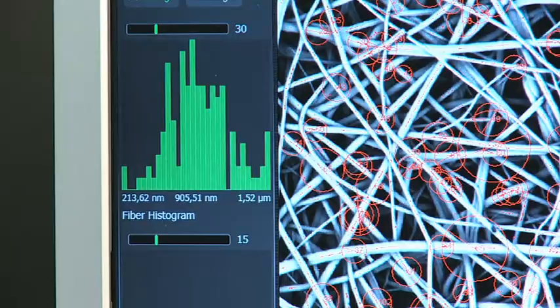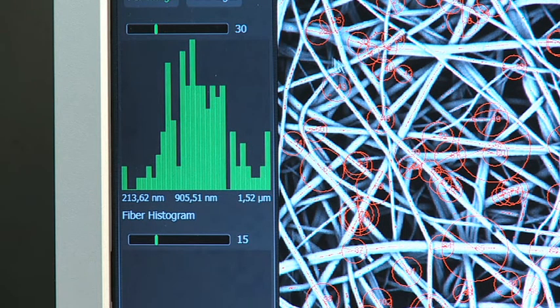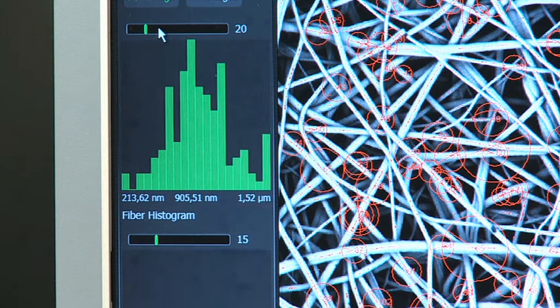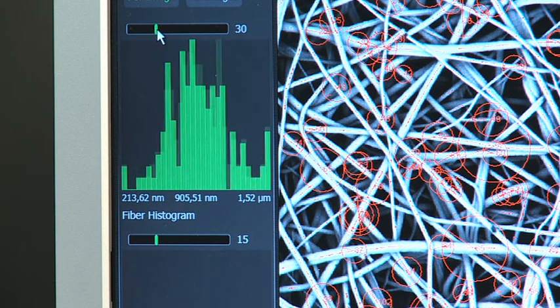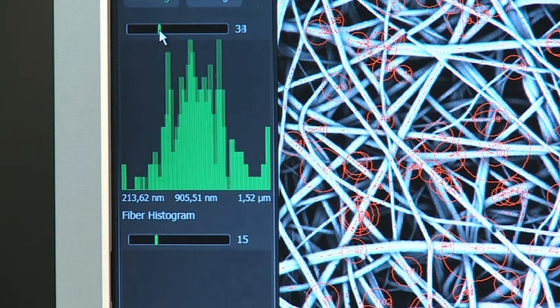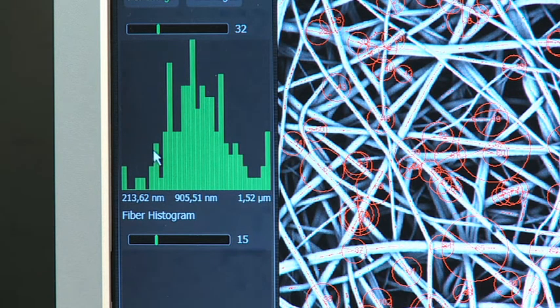The interactive histogram on the left can be scaled with different numbers of bins. Average fiber size is displayed underneath the histogram. The range and frequency of the individual bars is displayed when the mouse is moved over the histogram.